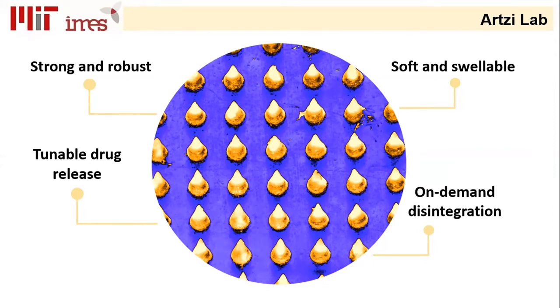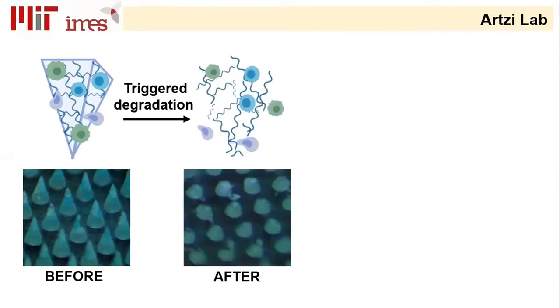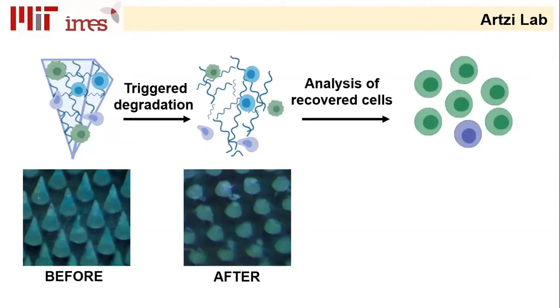Engineering the microneedles so they would have this on-demand degradation feature was really challenging because we had to ensure that the disintegration process wouldn't damage the cells. Otherwise, this could have biased our readout. Finally, we had our eureka moment, and we identified a top polymer. We included in the structure of this biomaterial what could be defined as a chemical switch. So when we turn it on with a reagent, we can dissolve all the microneedle in less than 5 minutes and analyze the different cellular populations and soluble biomarkers that are entrapped inside.